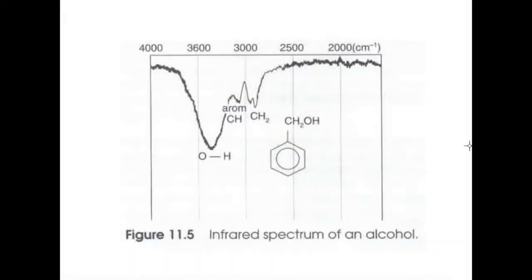The next spectrum. This spectrum also has an aromatic ring, though it also is not the complete spectrum. It has a hydroxyl group, so there's two features in the spectrum that we'll want to examine. Two features that correspondingly will produce peaks. Well, the biggest peak here is this relatively broad peak, centered about 3500. That's due to the OH stretch of this alcohol.